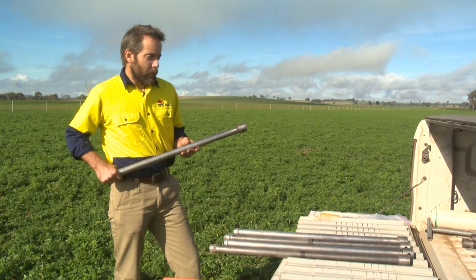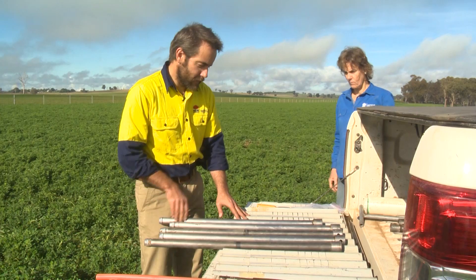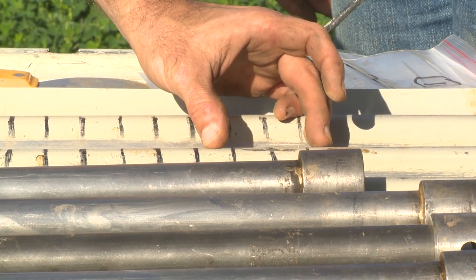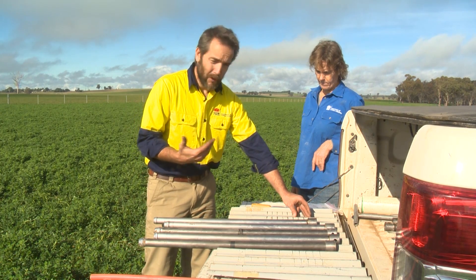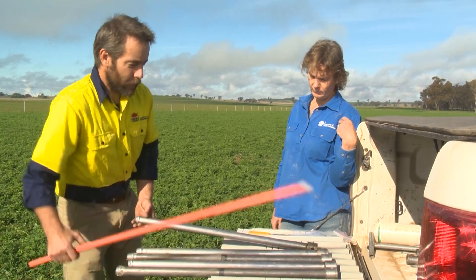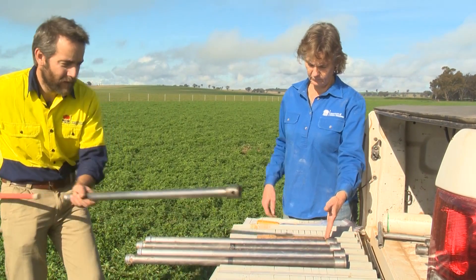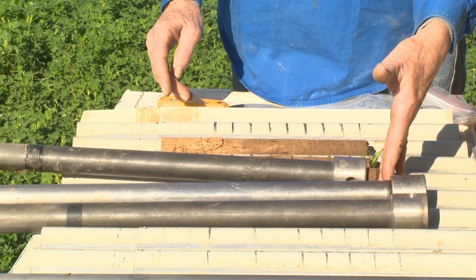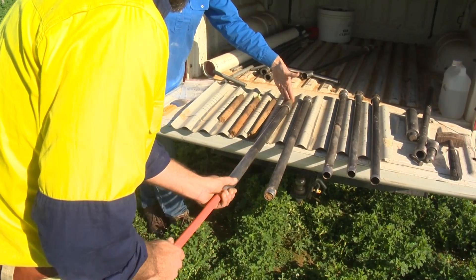Once you've got your cores, bring them over to the ute. On the tailgate we've got a piece of corrugated iron — you can lay the cores into the valleys of the corrugated iron, and we have marked here the sampling depth intervals we want to use. In this case we've got 2.5 centimeter intervals, which we use in research, but for commercial agriculture 5 centimeters would be adequate. Once they're on the tray, we simply push the cores out, which can be done pretty quickly. Importantly, we're not contaminating samples and we're going to get the depth increments quite accurately.